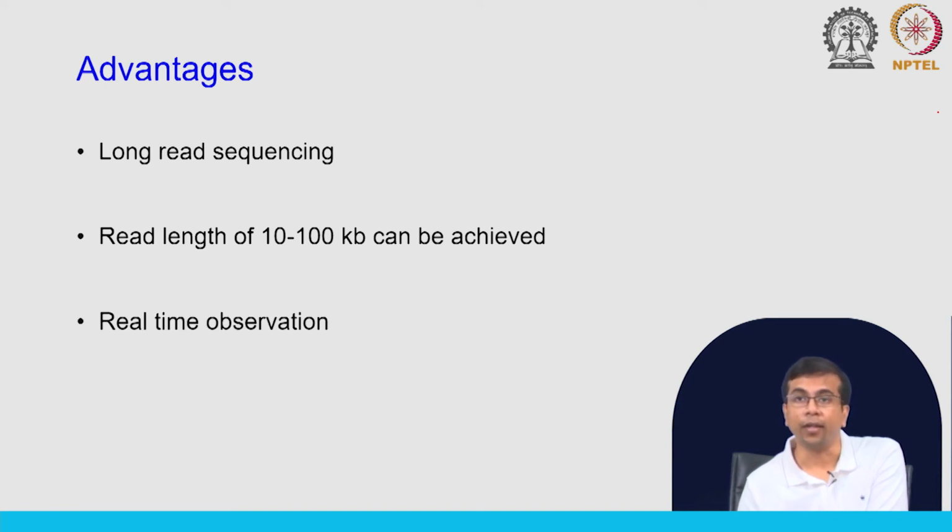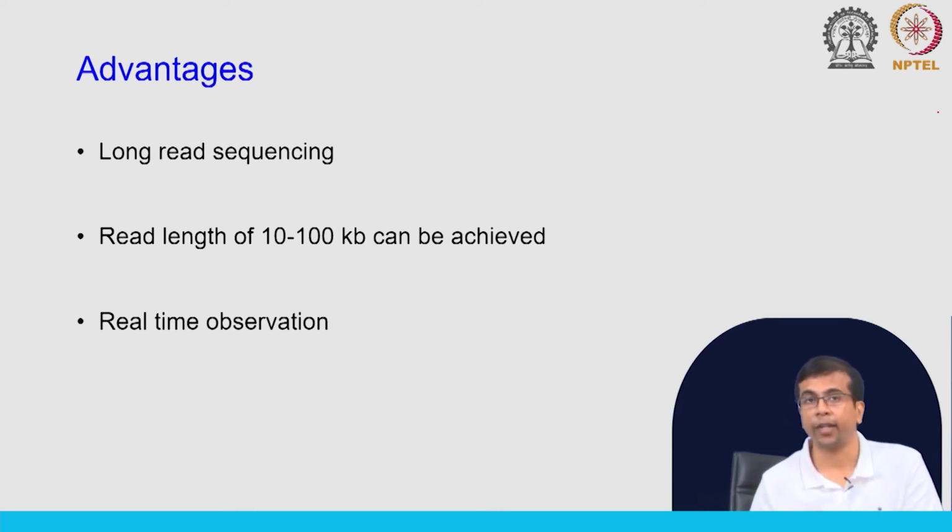Okay. In addition, as you have seen with SMRT, we have real time observation of the current, the change in current that is happening, right, that is the signal. We have real time observation of what is happening to the current with respect to time, and this data is stored in the data file that comes from nanopore. So, when we talk about these data formats, you will see we have this data in there, and that can be quite useful for specific applications.